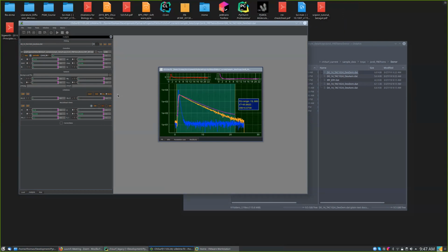Now I'll go through all these parameters that are relevant here for the model. Yes, just very quickly. So here LB, this is the background of the response function. If I read here, you can see it's roughly 10. So let's put here 30 as the starting parameter. TS is the time shift. So you see if I put 10, the response function shifts. Let's start with 0.